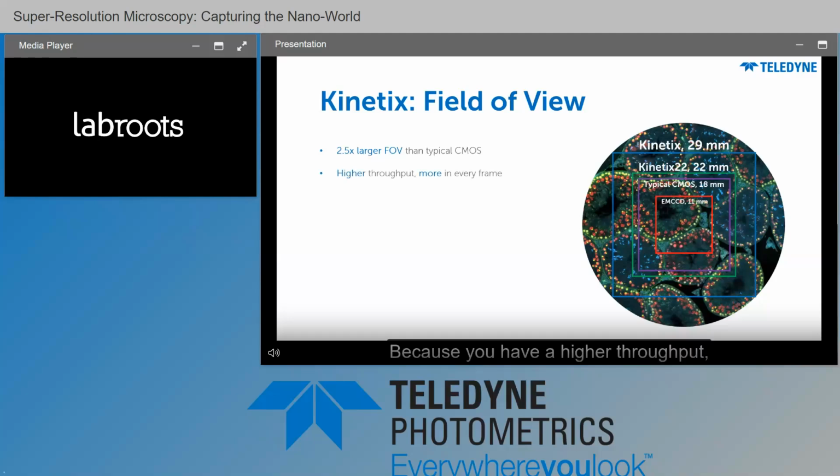Because you have a higher throughput, you have more data in every single frame. That means you don't need to tile or stitch across your sample. You don't need to take multiple images. Every single image you take has more information in it. You don't need to take as many images. Your imaging experiments are over faster, and your sample has less light dose.